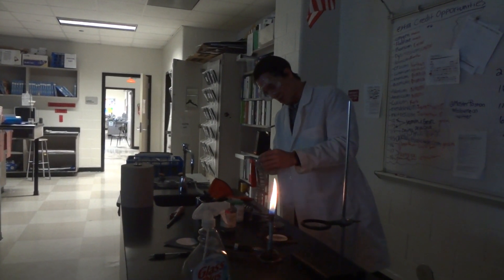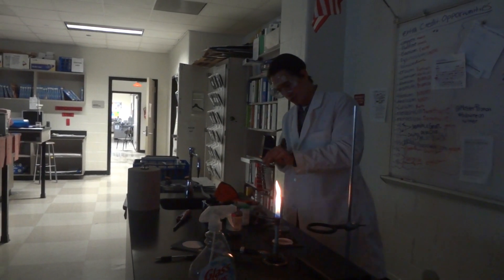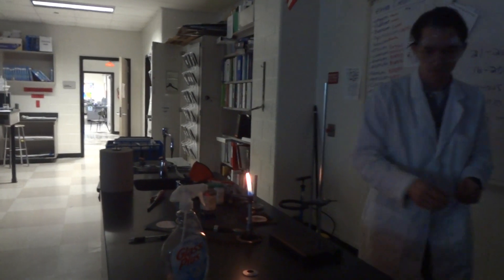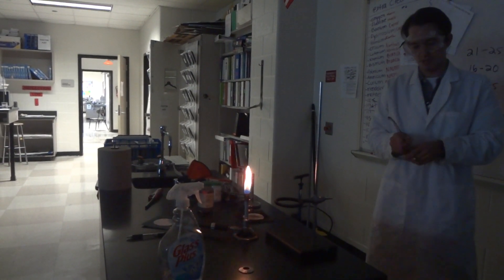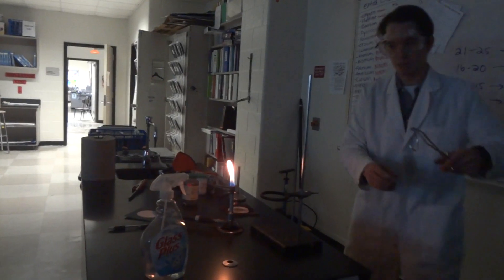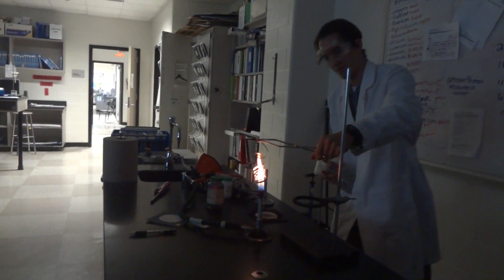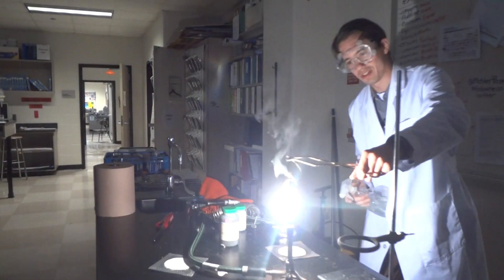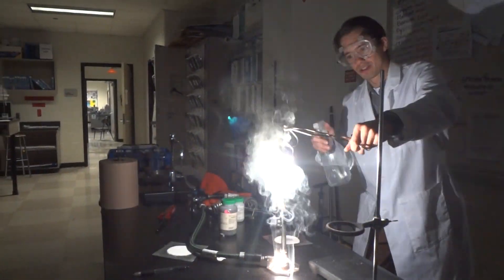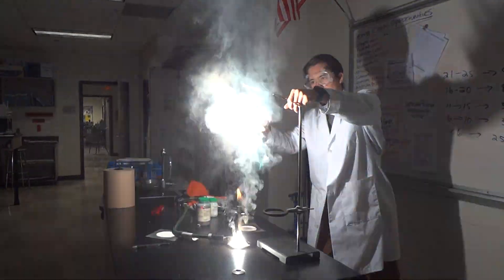This is going to happen real fast. In this case, I'm going to hold it with the tongs. Notice that I will first burn it and then spray it with water — notice the difference. Watch very carefully. Keep the lights off. This is magnesium, guys. Watch what happens when I spray it — it actually gets brighter.